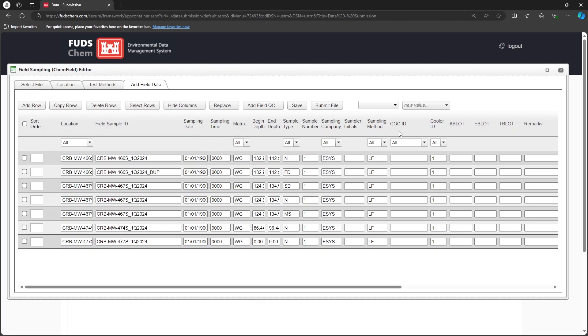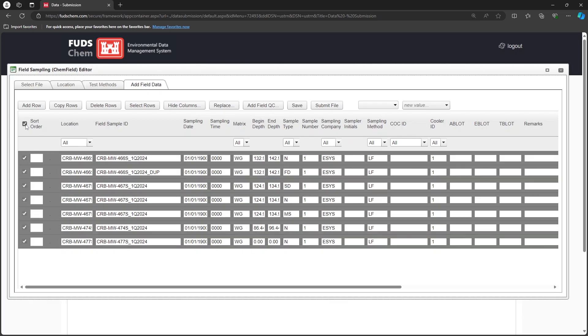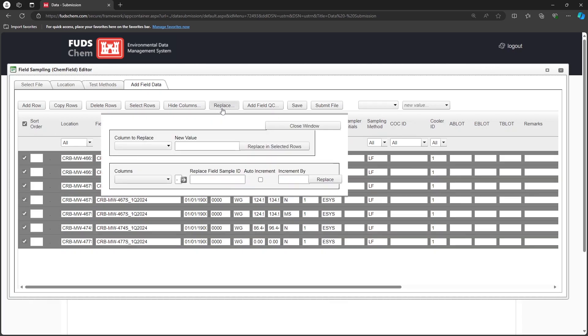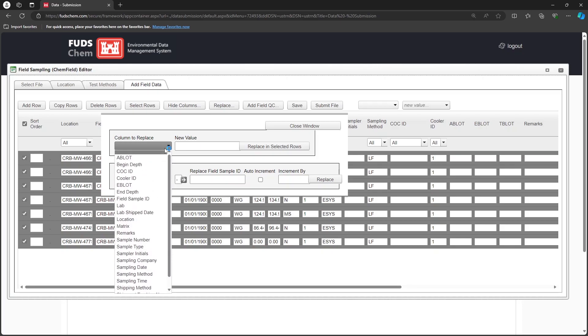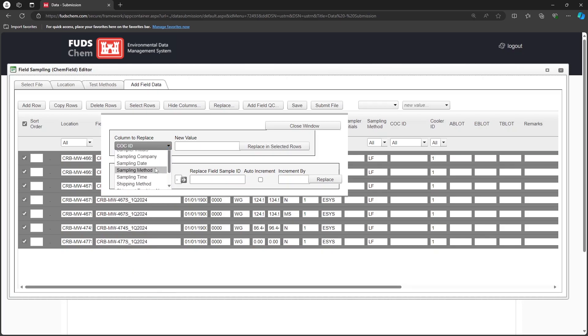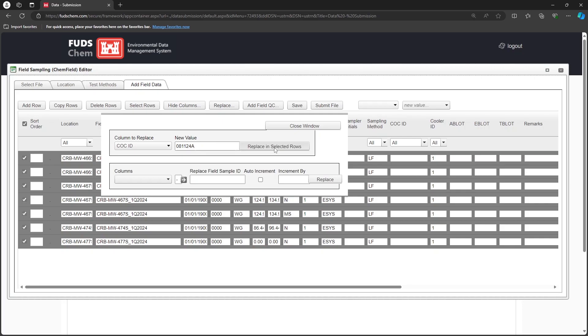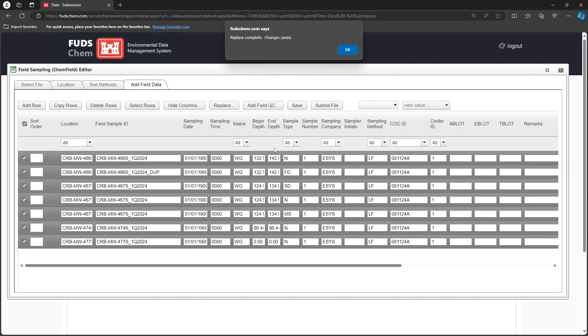The CoC ID is determined by the contractor, and does not affect the lab. To populate this field, select all of the samples and click Replace. Select CoC ID and enter a new value. Ours will be 081124A. Then click Replace in Selected Rows.